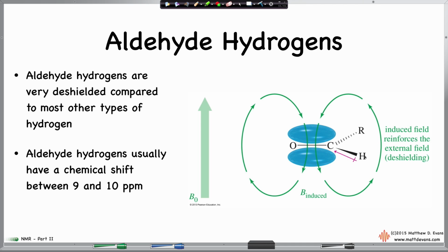So easy to spot that in the next laboratory experiment, or if we're already doing it, it's called the oxidation puzzle, and one of your jobs is to figure out how much oxidation occurred in a molecule, so you're going to have to figure out whether a ketone was produced or an aldehyde, and I strictly forbid you to use NMR because NMR would really tell you pretty quickly whether the molecule became an aldehyde or something else. Okay, you're only going to use IR to do that, but NMR would be really quick and easy. Okay, so the effect is fairly strong here, a lot of deshielding of this hydrogen, and the values are 9 to 10. Nothing else except for aldehyde hydrogens appear in that region. Really easy to spot.